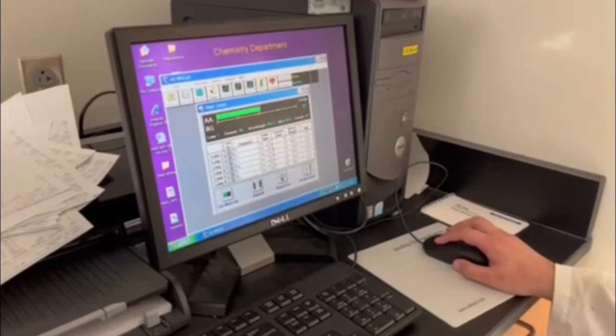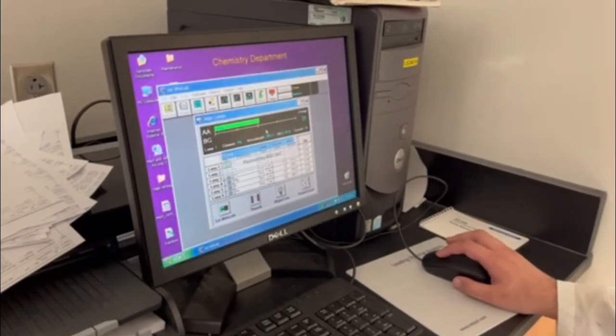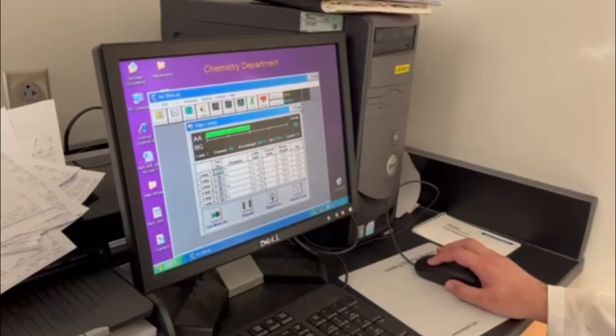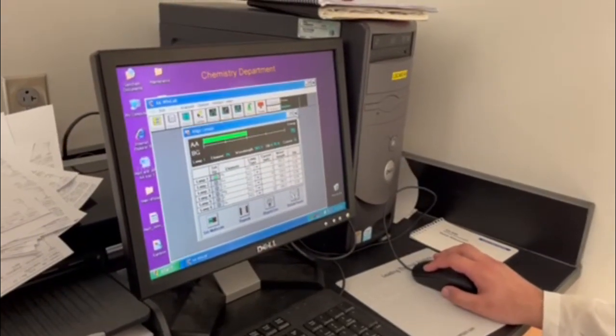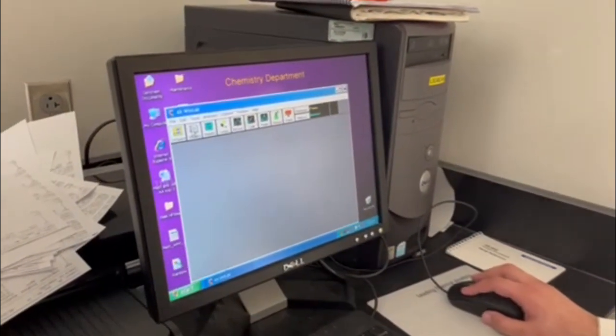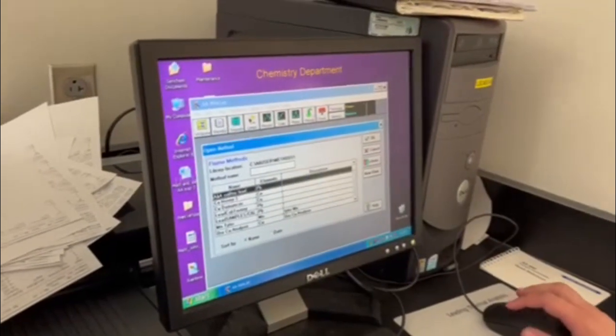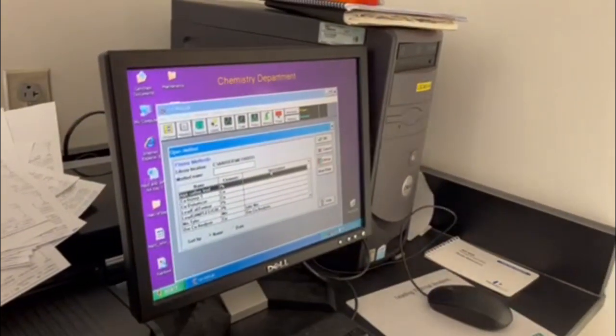The second is to go to the method editor, or MEthEd for short, in the tabs. When that shows up, you must select the element that you will be observing again.